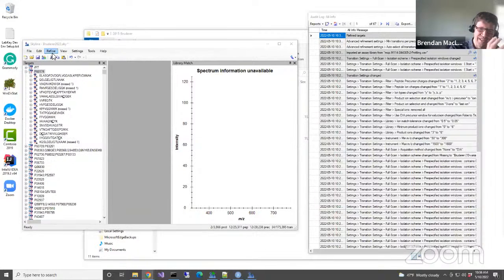Obviously when I started Skyline, there were no analyses with Skyline. So I had to put a lot of effort into exporting transitions for a triple quad, but I also wanted to be able to go back to older experiments where the data was already collected and review them. We still put a lot of effort into both sides: here's how you do it natively in Skyline, and here's how you get something from somebody else. But I recognize that a lot of people will ask, what if I don't have one of those CSVs? Well, then you would do something very differently.